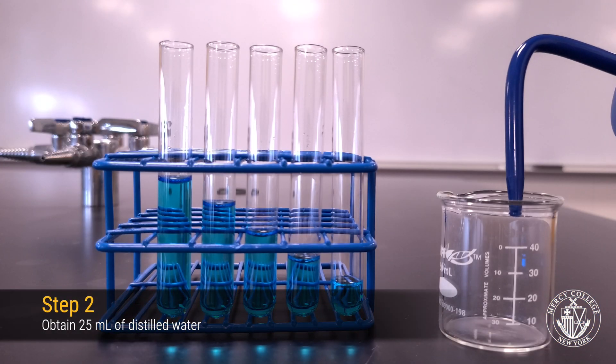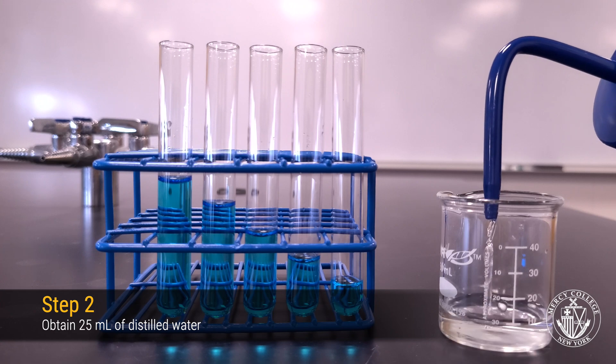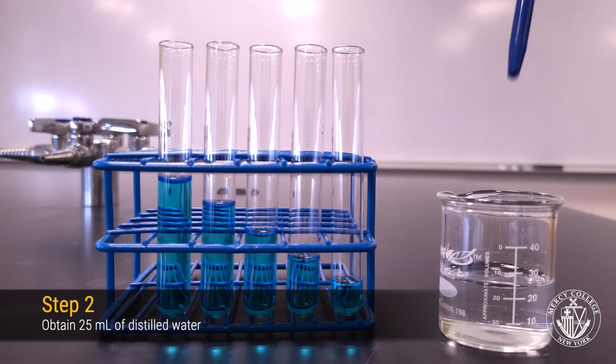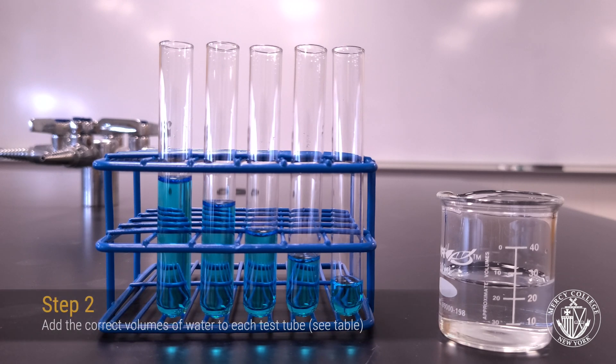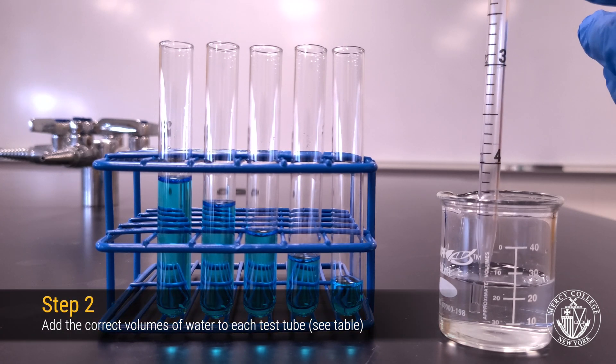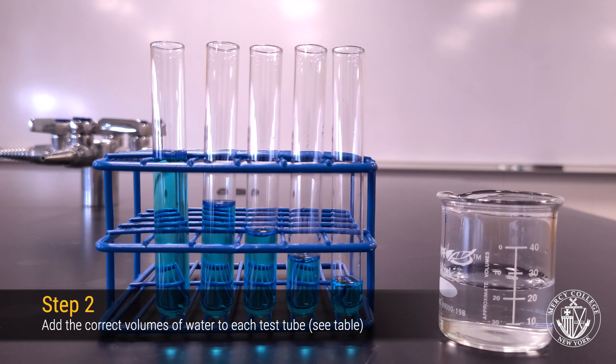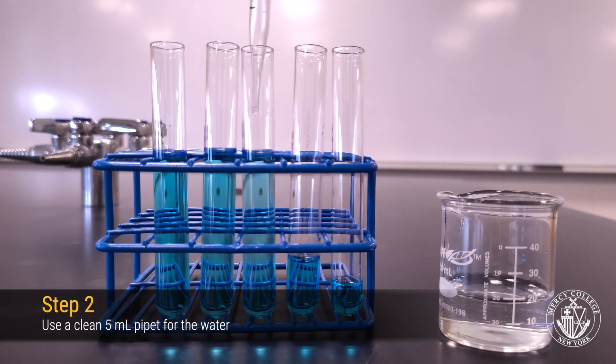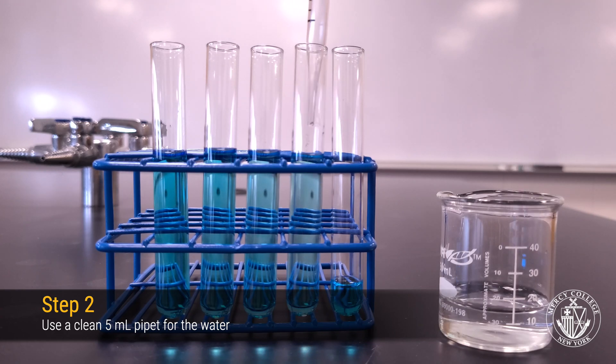For the next part of the experiment, we'll need 25 milliliters of distilled water. Using a clean pipette, transfer 1, 2, 3, 4, and 5 milliliters to your test tubes so that the total volume in each test tube is 6 milliliters.